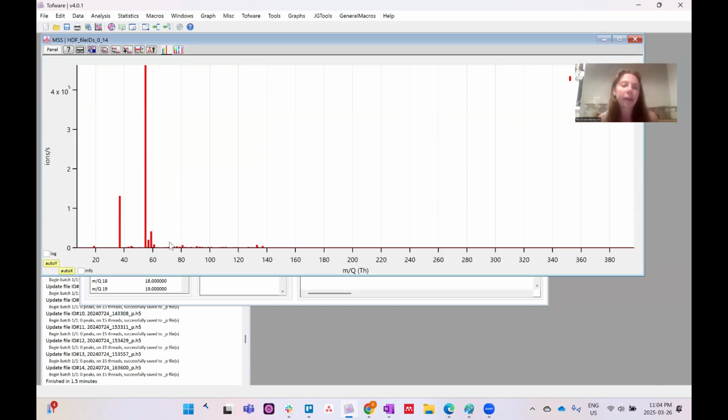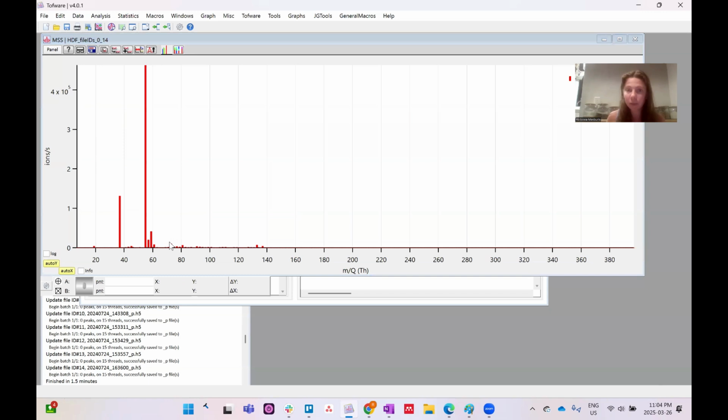Now we get a mass spectrum, and this is where I'm going to recommend that we do our sanity check and confirm that, yes, a mass calibration was not needed here. If this was for research purposes, I would certainly do a mass calibration and refine the peak width and shape, but these are all things that we will learn in class together in 2 weeks or so.